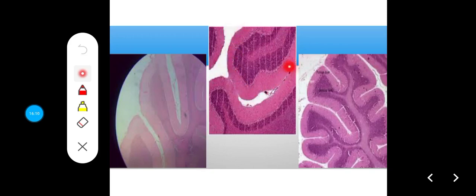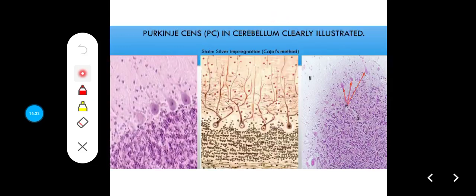But notice one thing that is consistent. The branches of the tree contain a deeper staining structure inside. Look at this. This one also looks like a tree, with a deeper staining structure inside it. So this is just like a part of the cerebellum which is cut out.